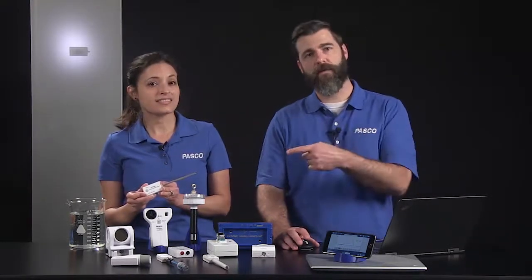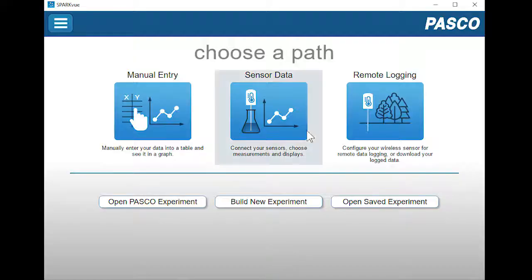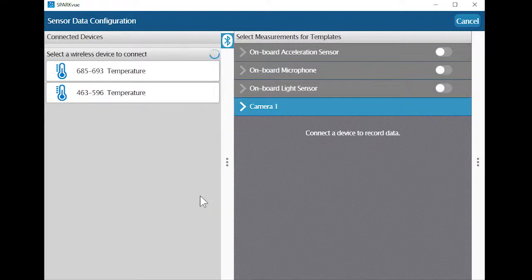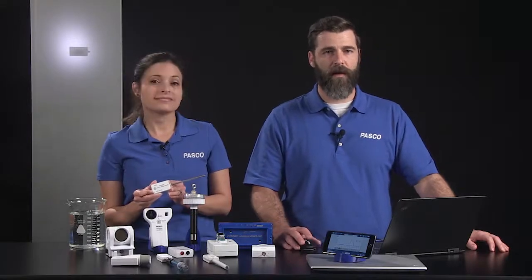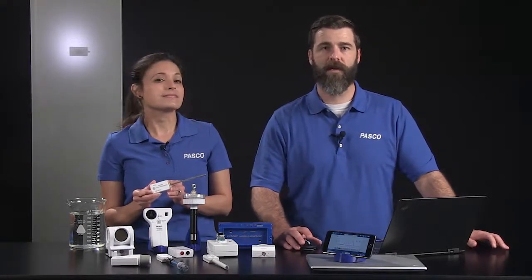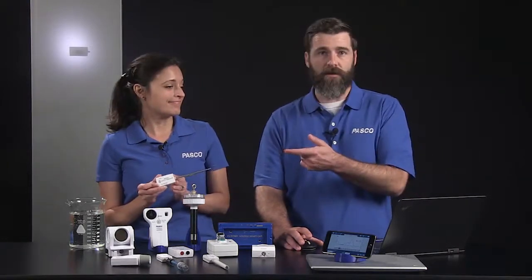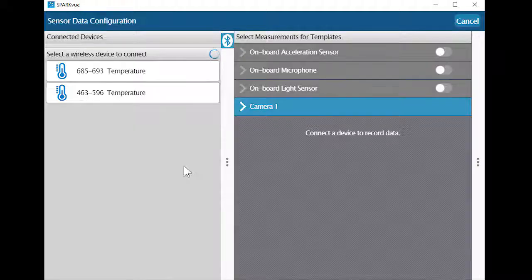I'm going to connect the temperature sensor to this laptop through the sensor data path in SparkView. When you select sensor data, the sensor data configuration screen opens. The connected devices panel on the left shows all the sensors that are turned on and are available to connect. Our software uses proximity pairing to make it easier for students to connect the correct sensor in a classroom full of broadcasting sensors — the sensor closest to the device will be at the top of the list.